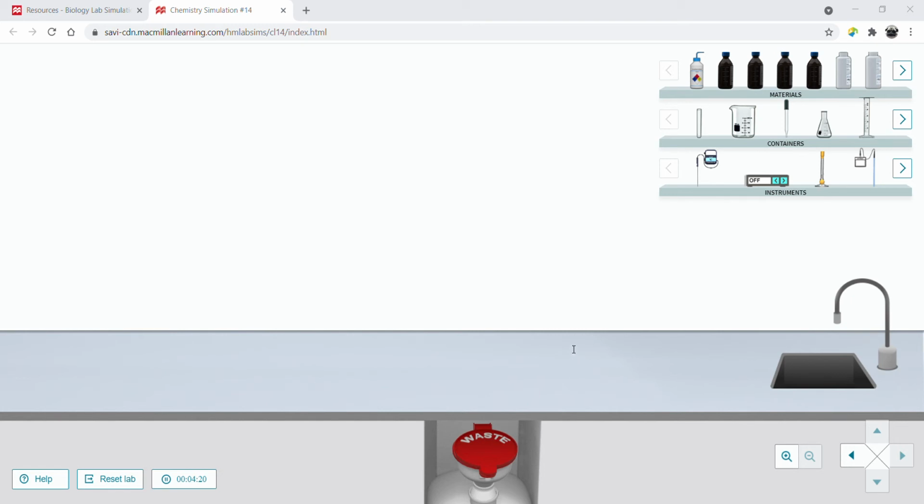If you go to page 3 of your handout, you see that you are to write your hypothesis in step 1. You can see it's highlighted. Go ahead and hypothesize which pH you think this enzyme will be most optimal at: pH 2, pH 6, or pH 10.